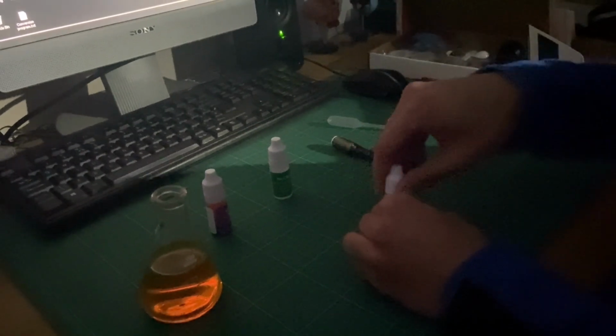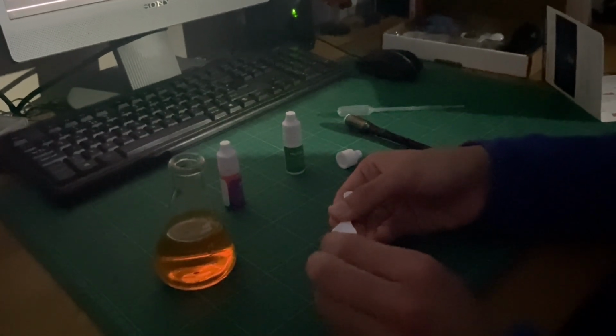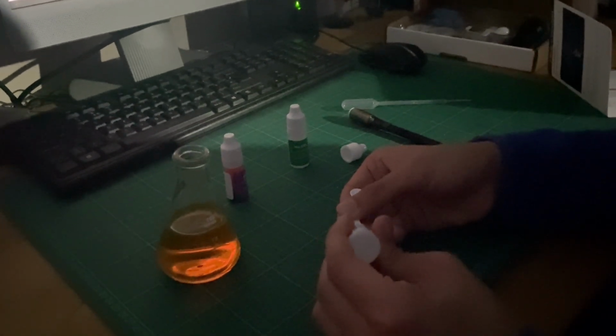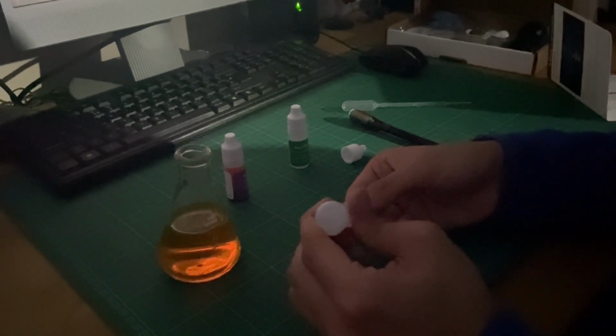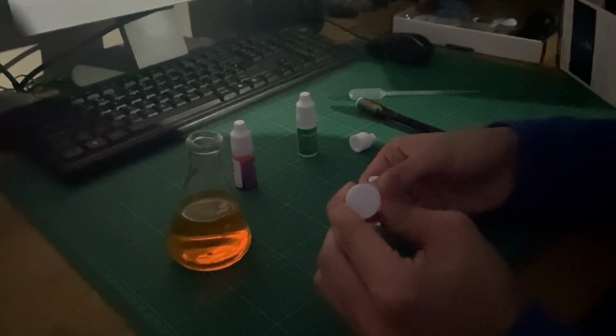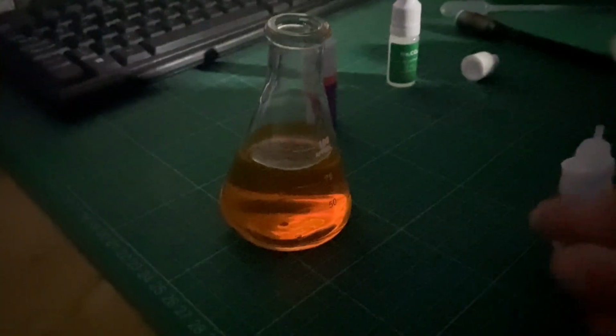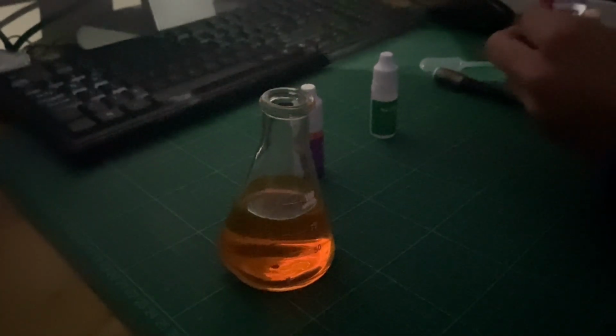After this, we added NaHSO4, or sodium hydrogen sulfate, which disrupts the delocalized electron system by protonating the COO- carboxyl group into COOH, which cannot share electrons into the system as well as it could before. This is because the hydrogen bond in COOH keeps electrons localized in one place, while in COO-, the lone pairs on oxygen are able to share electrons within the system. As a result of this disruption, when we shine UV light on the solution, now the glow is gone.